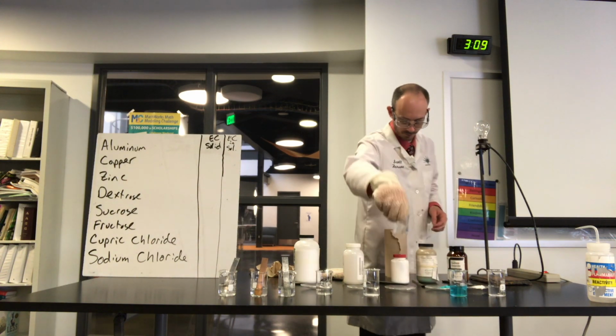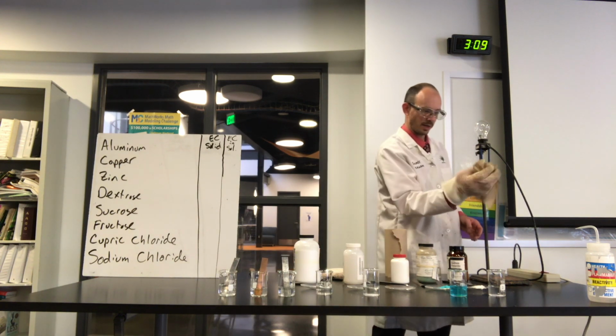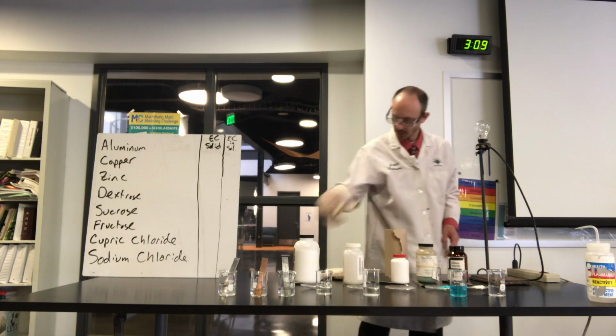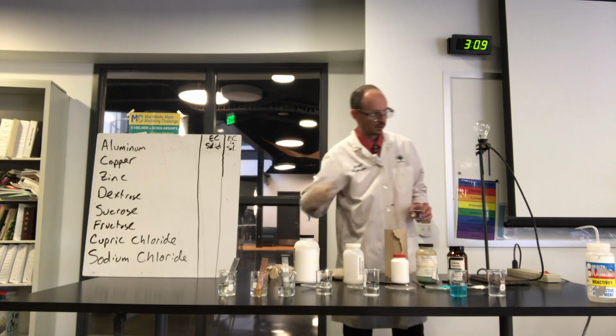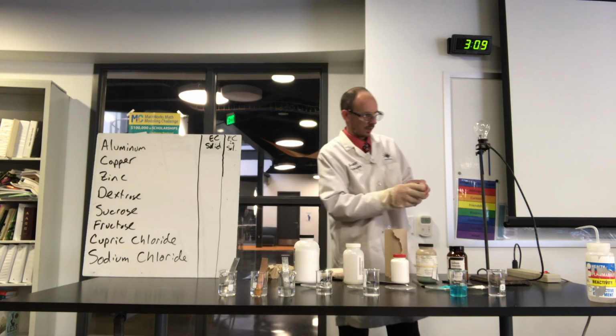All right. Off, dry them. And on, test. Okay, and go.